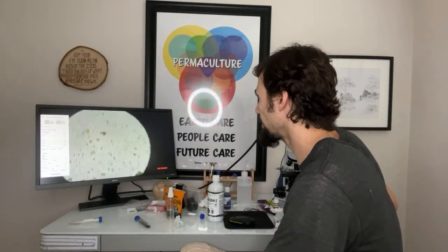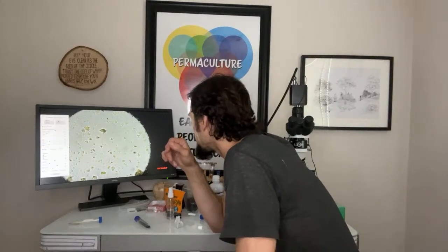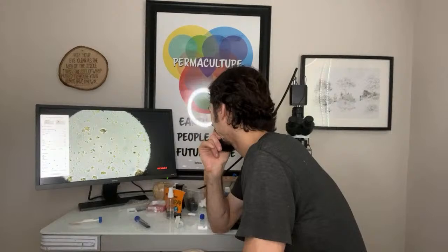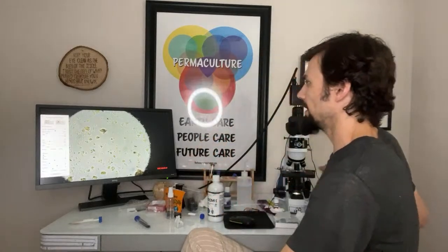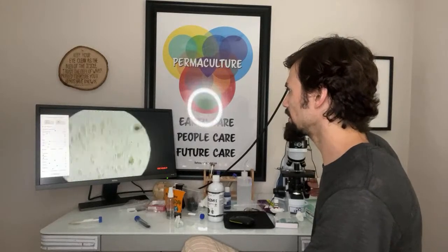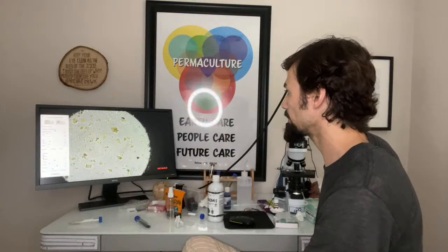I believe that's a spore right there. They're small though. Yeah, so compared to all the others, I see way less spores. And you know what? I see one right there.